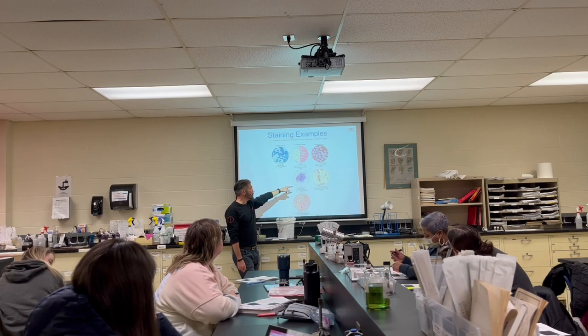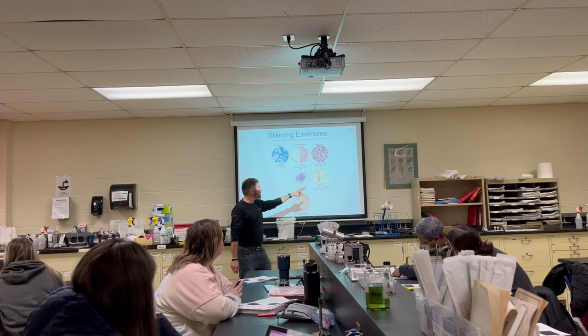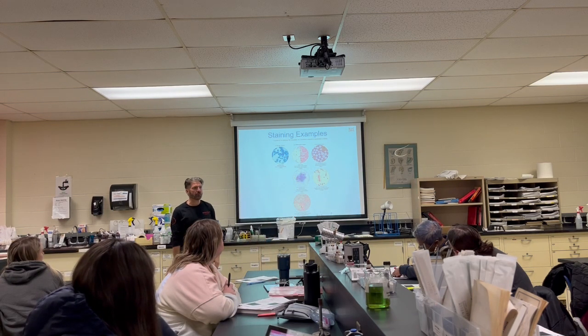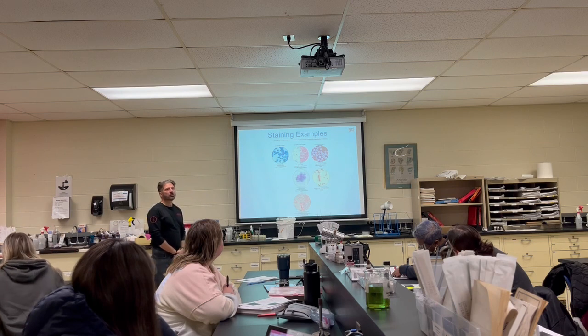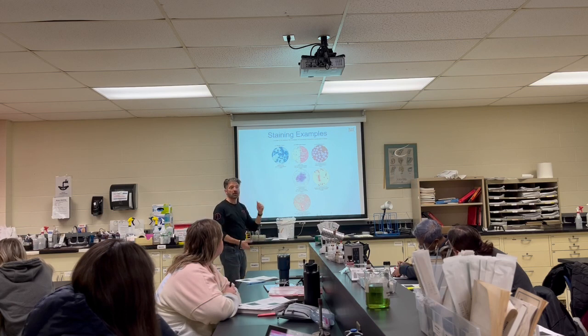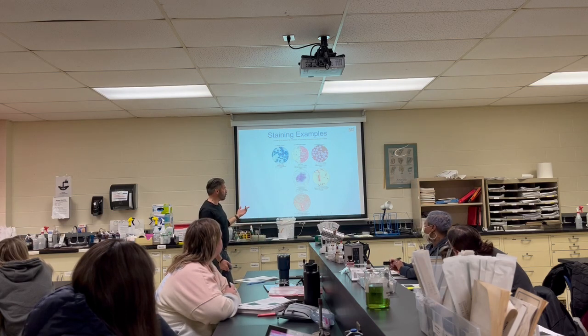Okay. There's a flagella stain of Proteus. All right. So, what do you think that this is, flagella all the way around it? Peritrichous. Peri means around. All right. So what do you think that guy can do? It can move like hell. All right. It can just rotate, shift, pivot, whatever it wants to do.